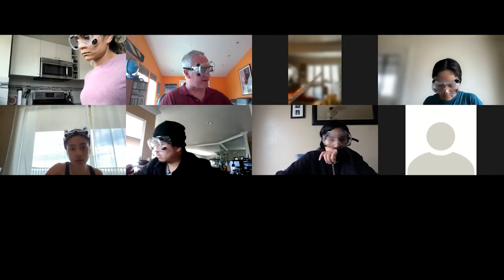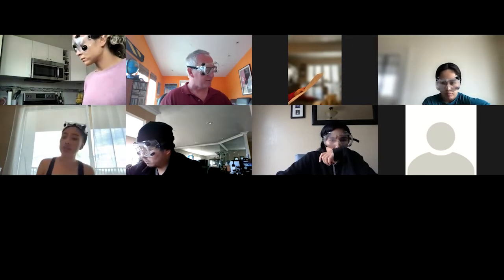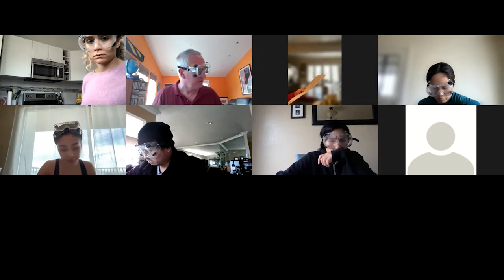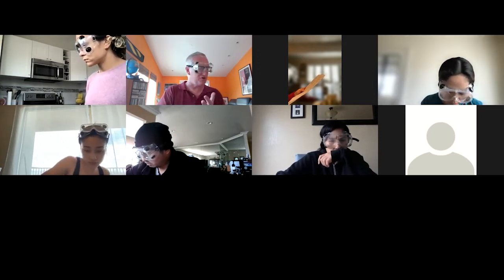If you just put the top back on for a couple seconds, it's out. I'm not going to close it tight though, because it's still hot. So I'm just going to let it cool for about 2 minutes or so.